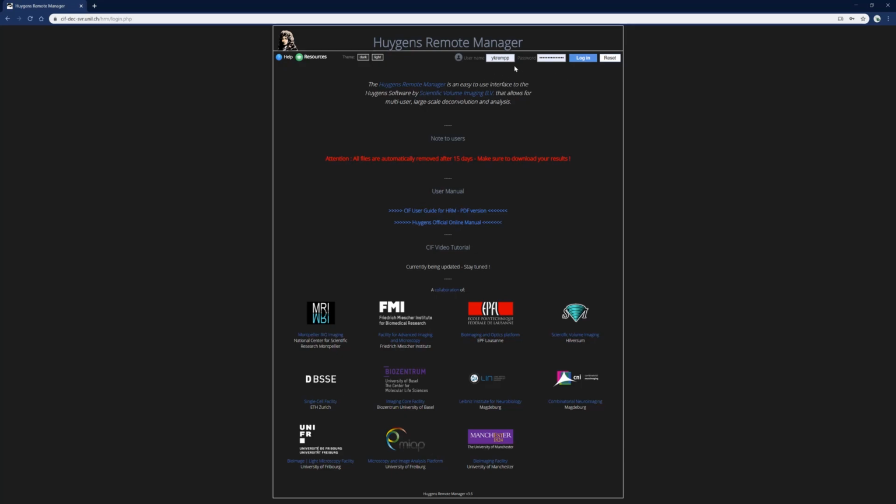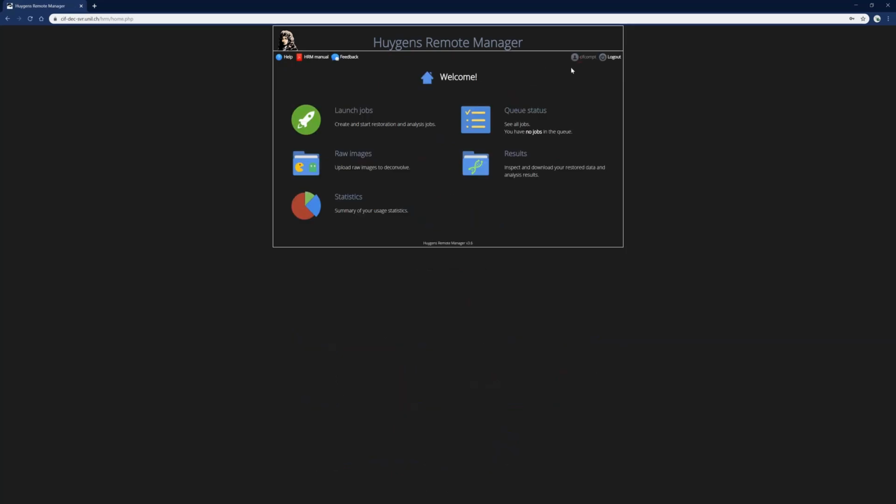And for demonstration purposes, I will use here a service account like this. And then press login to enter and see the home page. Here we go.